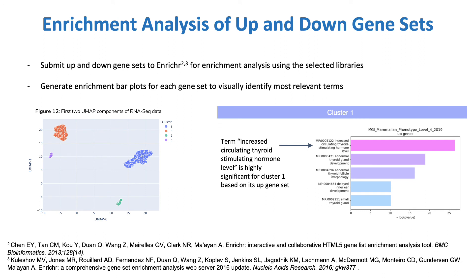I use the up and down gene sets for each cluster to query Enrichr, a web-based tool developed by the lab for enrichment analysis using a variety of libraries. This generates a table of significant terms and their associated p-values for each set, which I convert into bar plots like the one shown here to visualize the most relevant terms per set per library. I also display the UMAP component scatterplot again, this time color-coding points by clusters for reference against the enrichment plots.